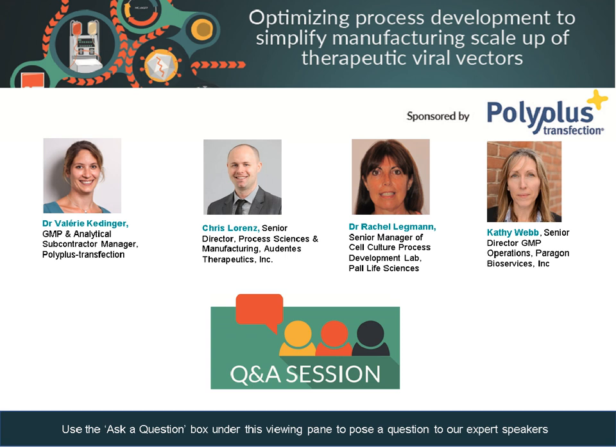I guess our clients are always looking for increasing titers in terms of making the process even more efficient. So I think there's probably some more work that can be done in terms of boosting up production levels potentially within the system itself, whether that is pushing cell densities and having media that supports the transfection and the growth of the cells, maybe feed supplements, things of that nature.